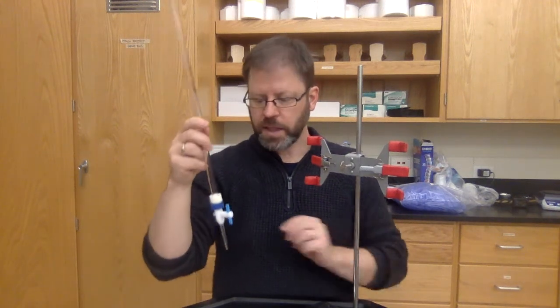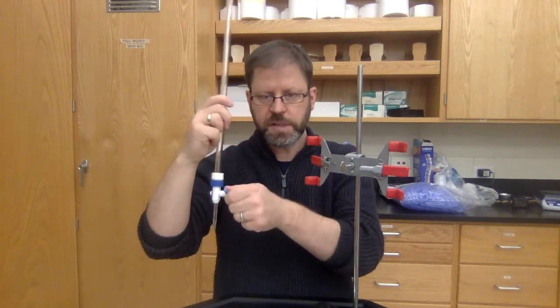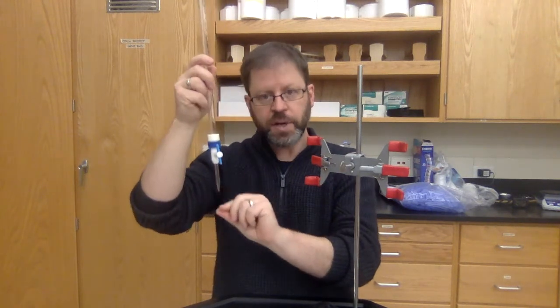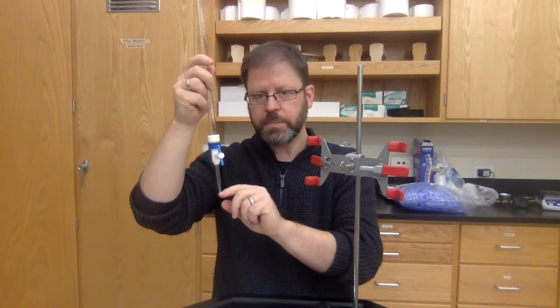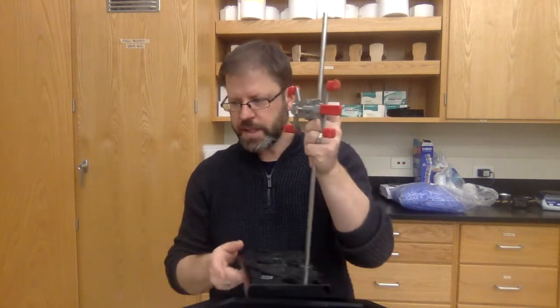Here's my burette that I'm going to use. It's always good to check these things a little bit first, like put in a little water or something like that and make sure that it actually comes out and there's not a blockage on here. Okay, so here's this thing ready to go.